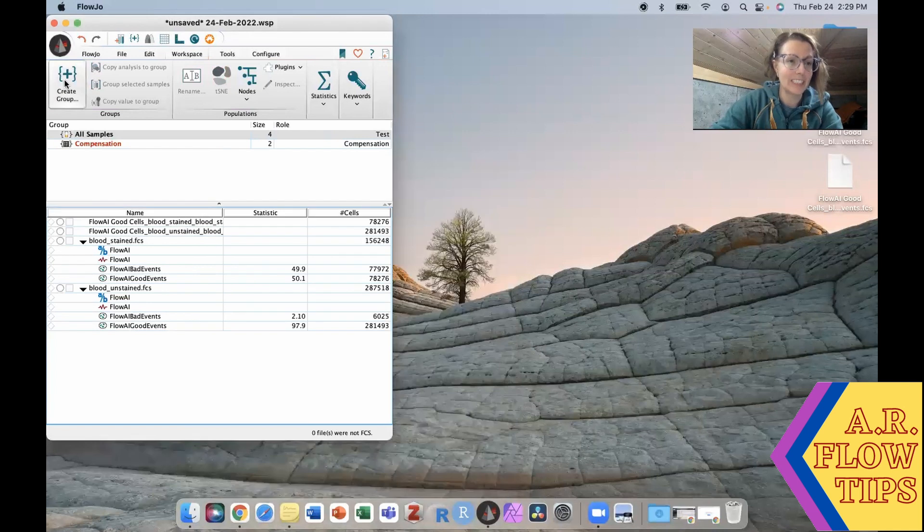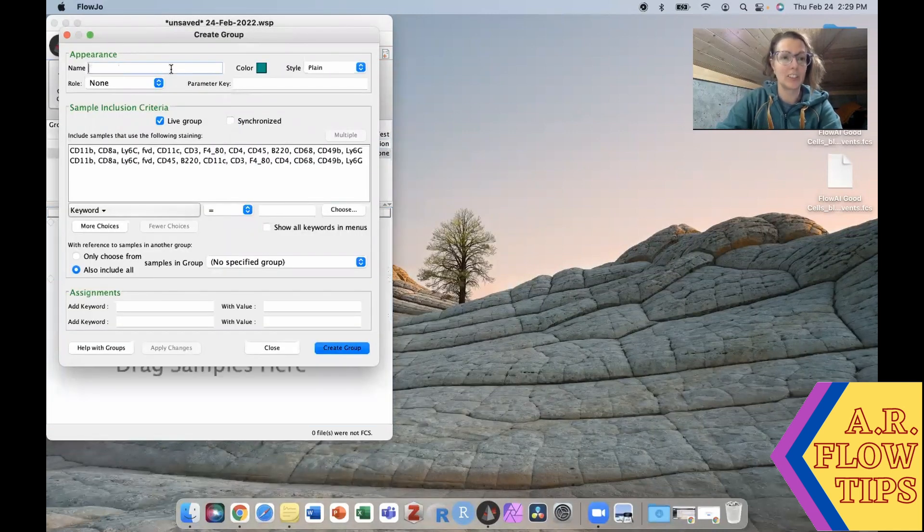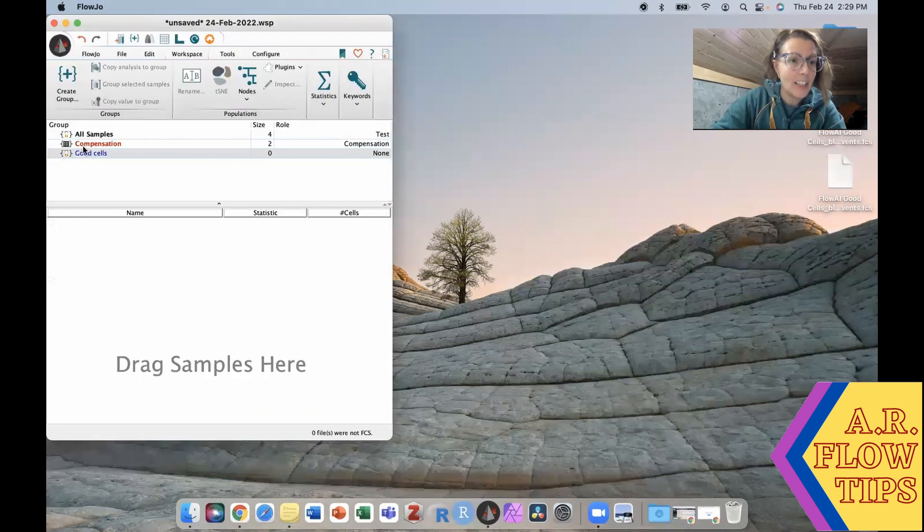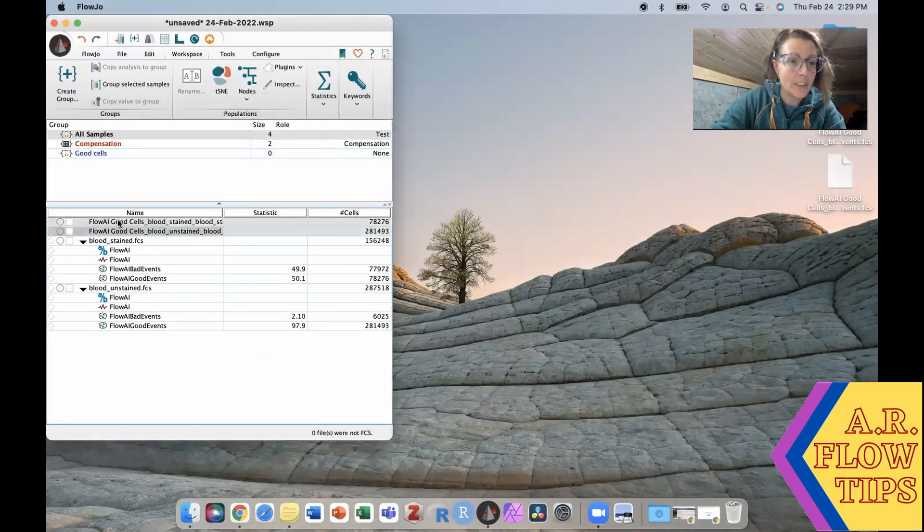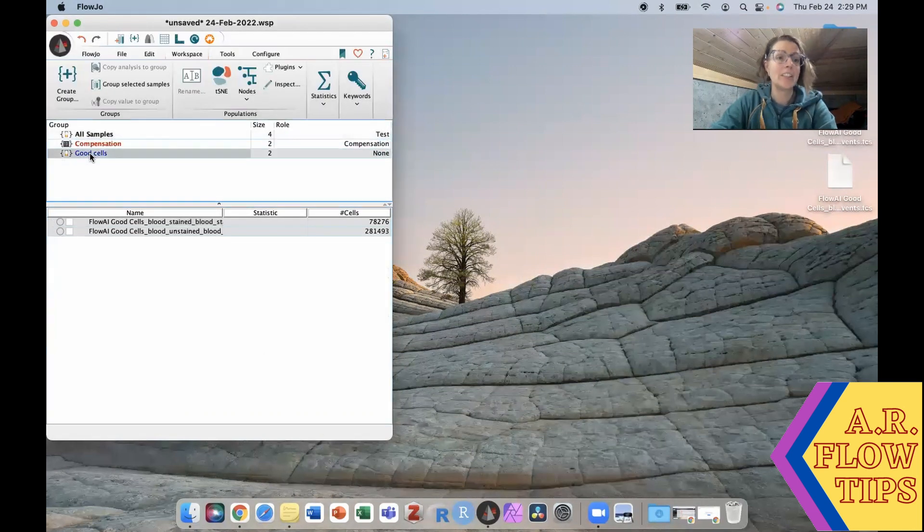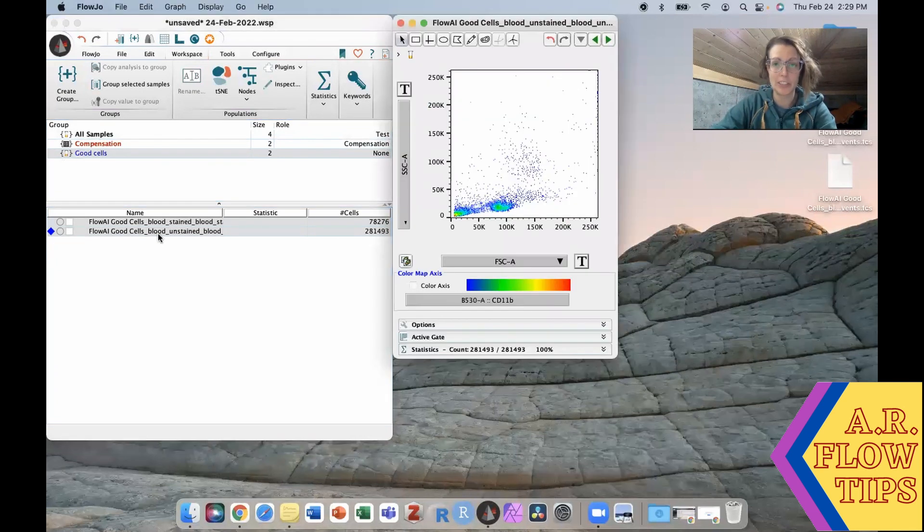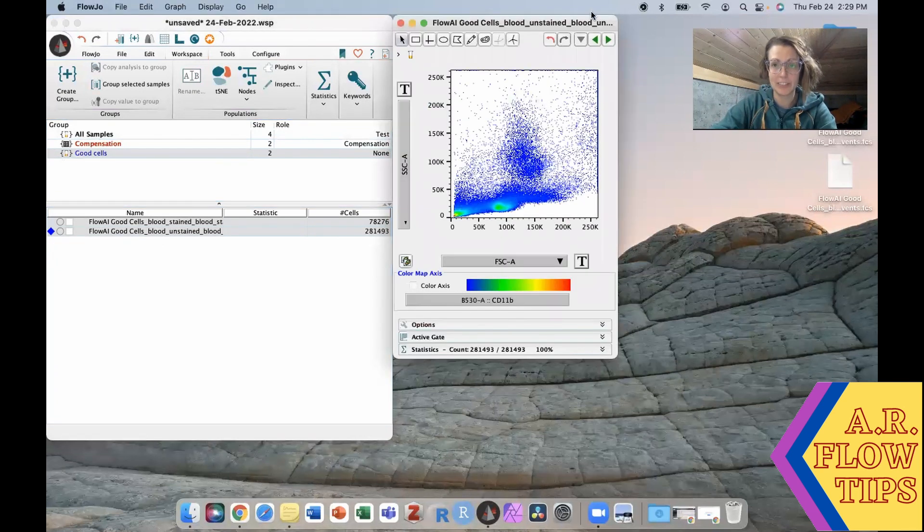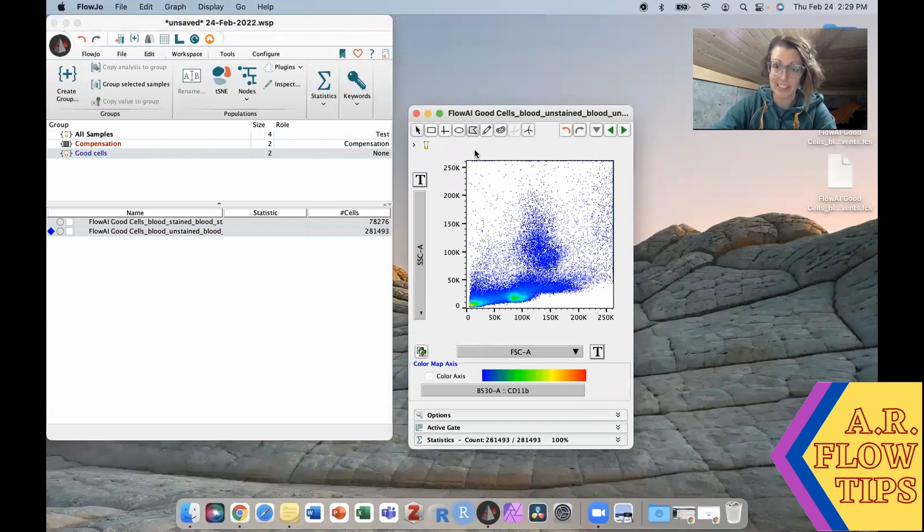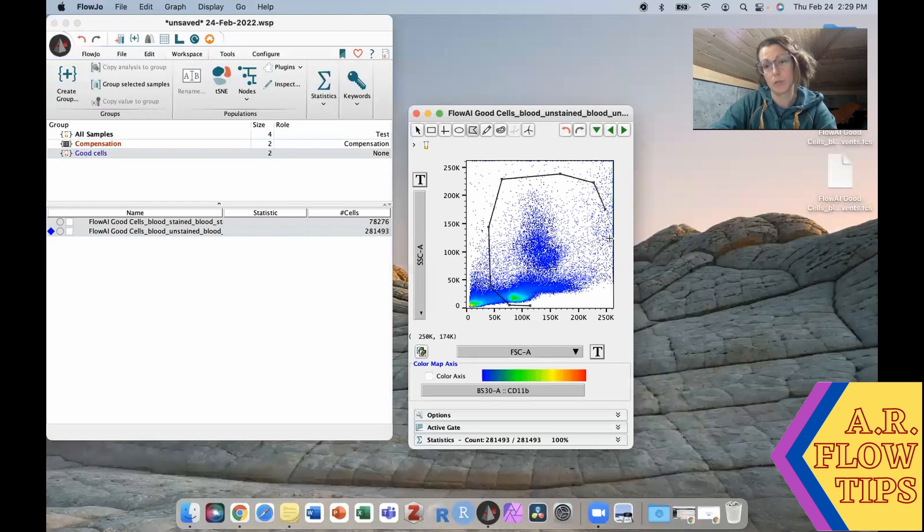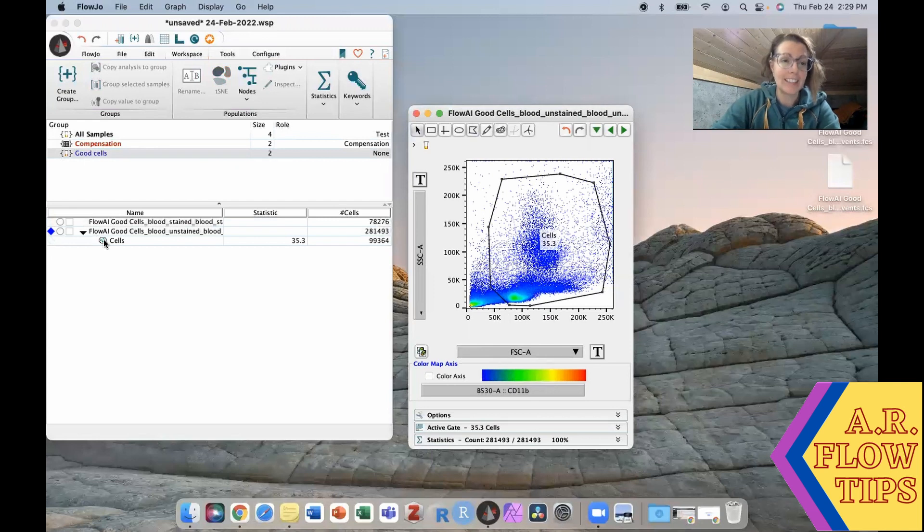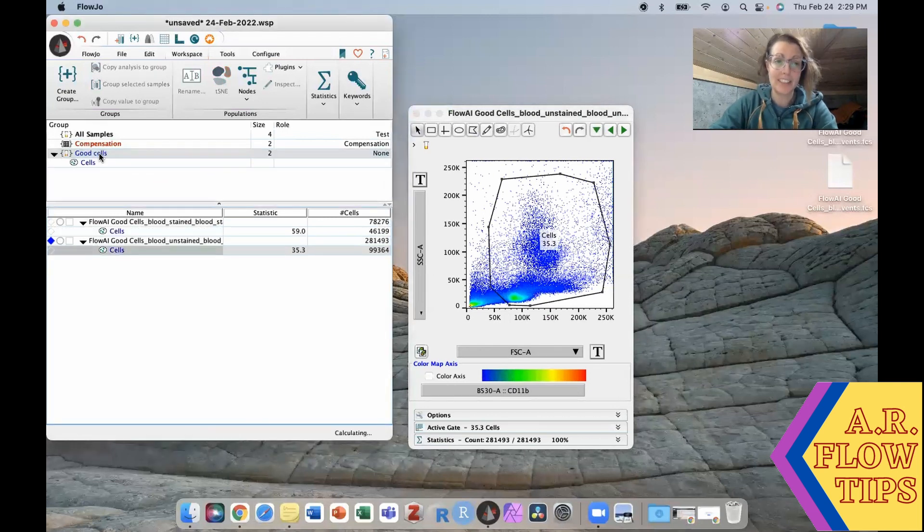All right, create a new group in here that is our good cells and we will bring those two populations in. So from here then we can go ahead and do what we were originally going to do and get our forward scatter side scatter gate set. So throw that in here. And now we can nicely apply this to the whole group.